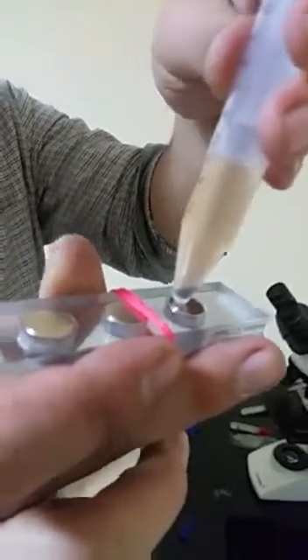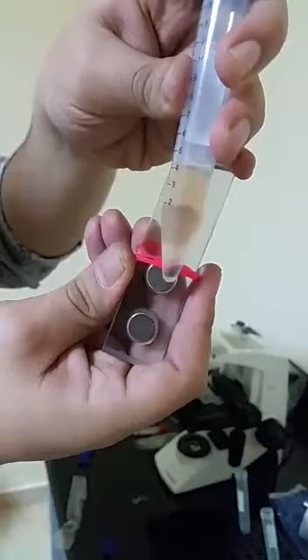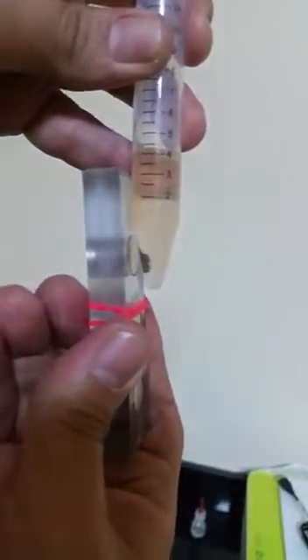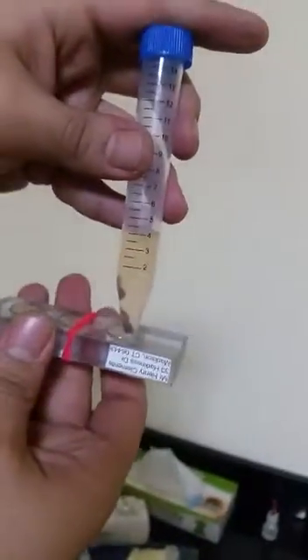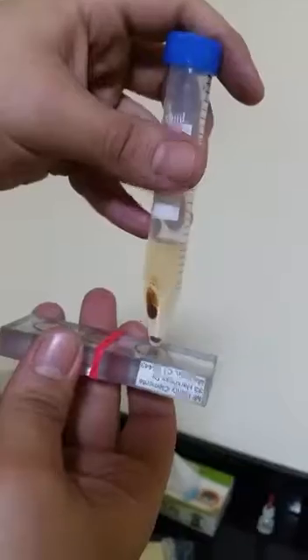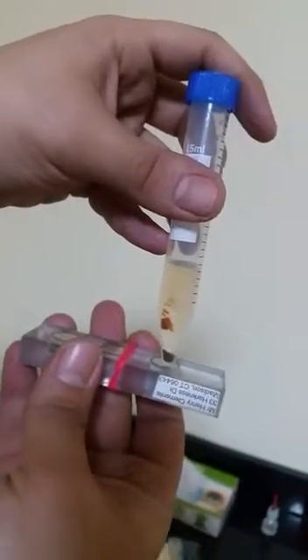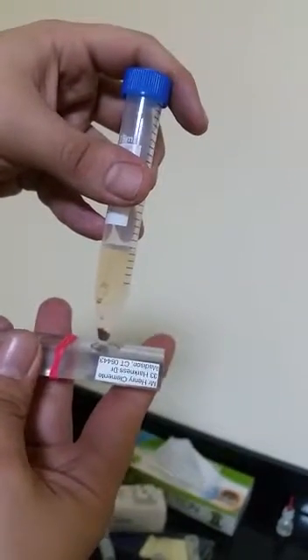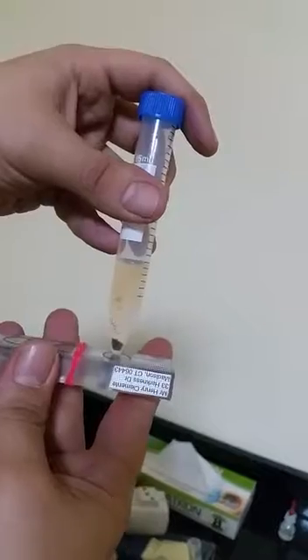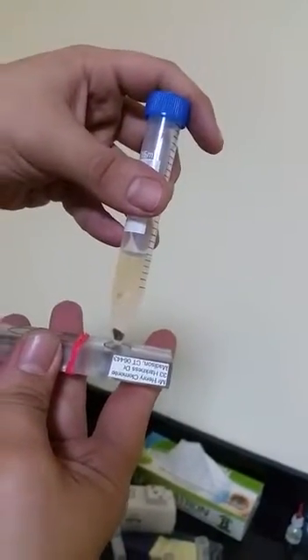Once you mix it in with the sperms or any cells after incubation, you just do the same trick. See, we'll put it here — look, it's moving. You can see it's simply moving with the magnet, very fast, very rapid. And the rest just takes some time until it responds with the magnet.